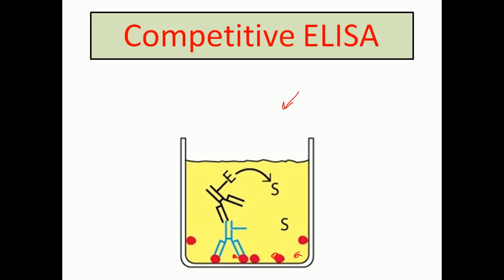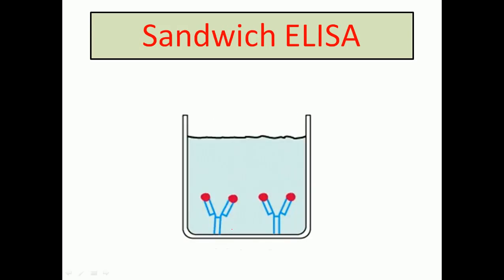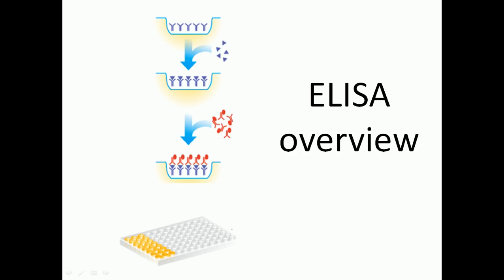If you look at the wells of ELISA, throughout the wells what we do is a twofold dilution from one end to another end. That means from the first to the last well, there will be twofold dilution all over the place. What twofold dilution is, we will be talking about in other videos.